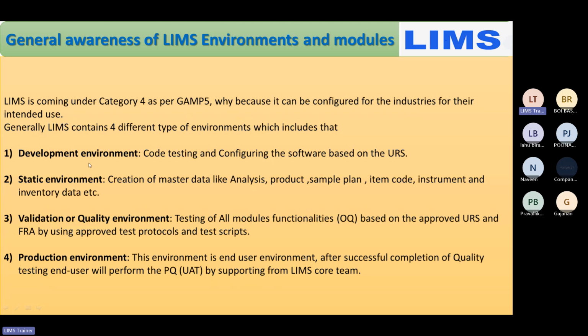The first environment is the development environment. For example, one IT industry is developing the LIMS software for a laboratory. How are they going to develop that software? By utilizing the user requirements. Different codes will be generated, and those codes will be tested and configured. This is how the development environment works.